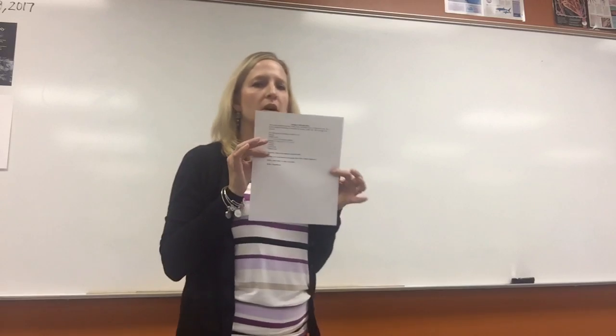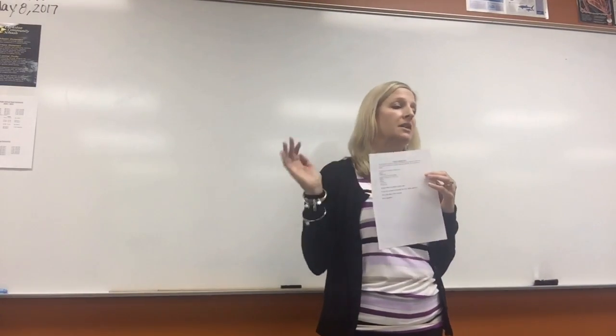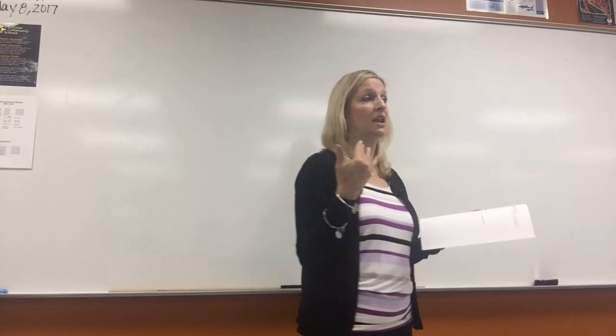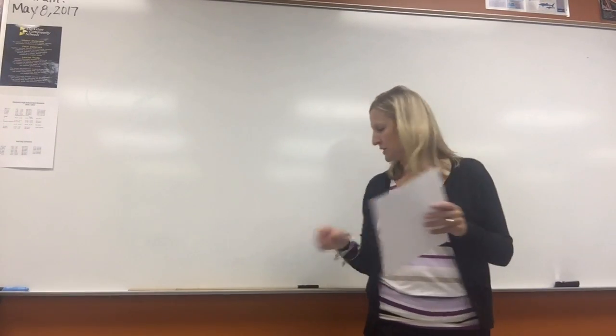Okay, you guys, so the sheet that says Osmosis Challenge Part 2, this is going to be Part 2 of our lab, a continuation of looking at osmosis, but this time we're going to look at osmosis in living cells. So the cells that we're going to use are potatoes.